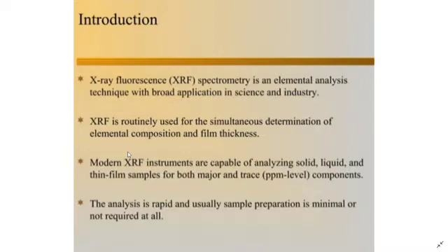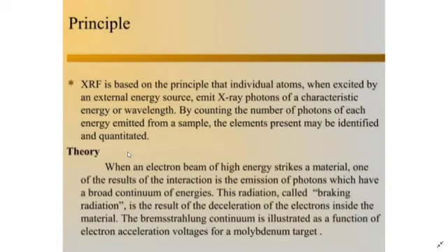Modern XRF instruments are capable of analyzing solids, liquids, and thin film samples for both major and trace ppm level components. The analysis is rapid and usually sample preparation is minimal or not required at all. XRF is based on the principle that individual atoms, when excited by an external energy source, emit X-ray photons of characteristic energy or wavelength.